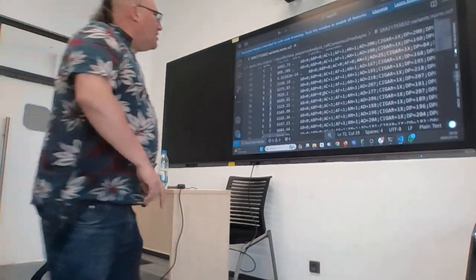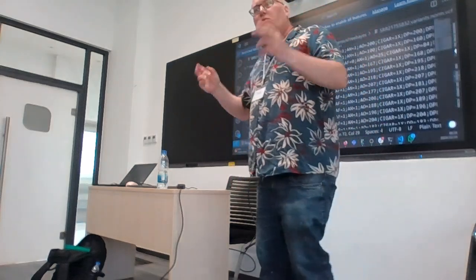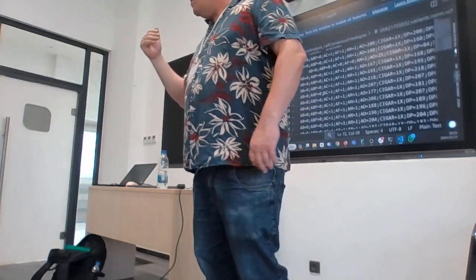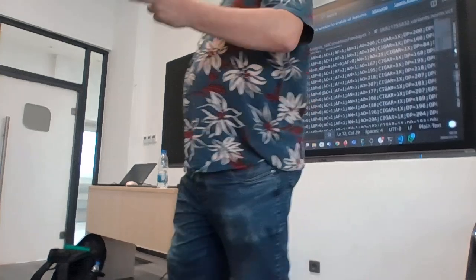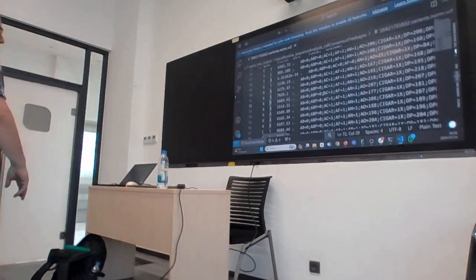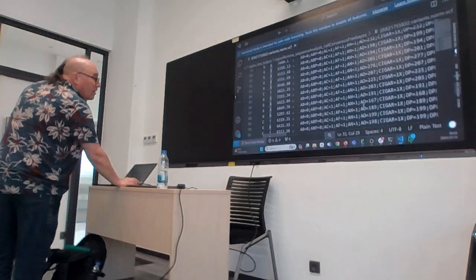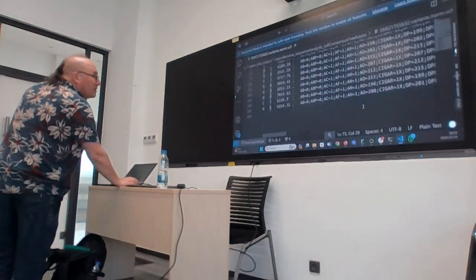Okay, so when we make the consensus, we put the good variants in and not the bad ones, right? So we put the high AF. I think we said 75% yesterday, or 80% or something like that. I'm going to try and see if there's any AFs that are in between. AFs, these are all 1s, 0s. I think this has been normalized.